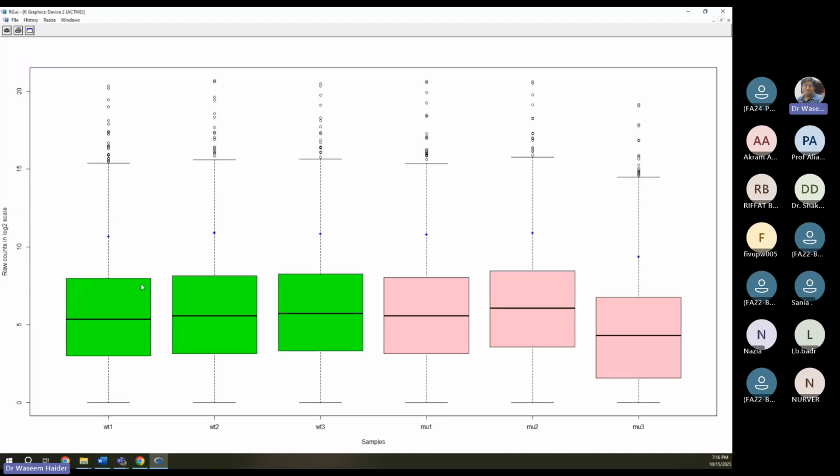Okay. So what we look for here is if the means are on top of the medians, it's right skewed. If the means are beneath the medians, then the distribution is left skewed. Skewed means more data on the left tail. Left tail means the small numbers. Right tail means the large numbers. Let me show you that as well.